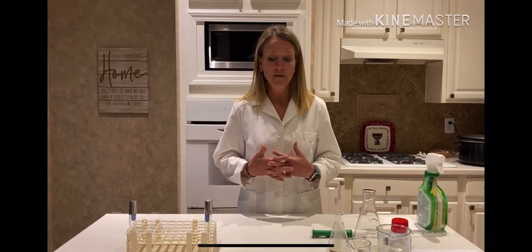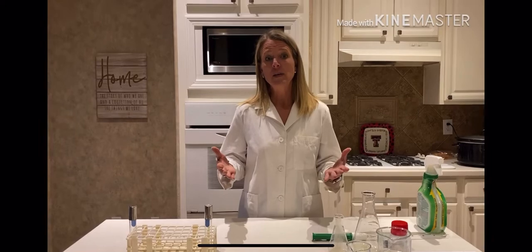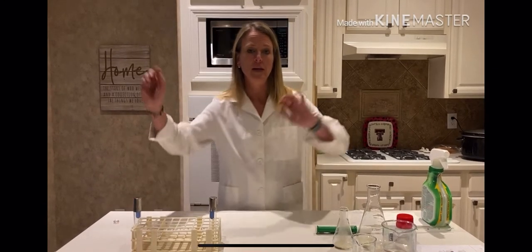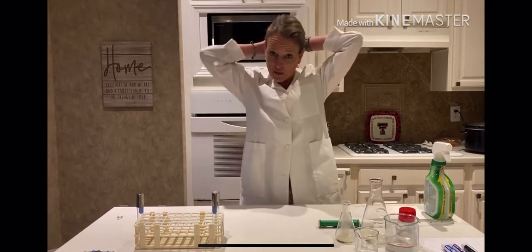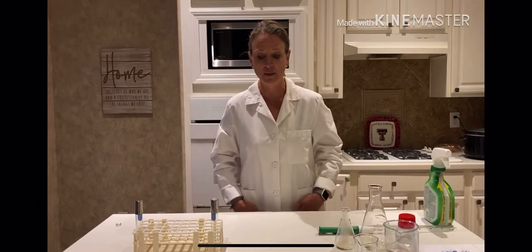First off, we have to practice aseptic technique. You'll notice I've got rings on my fingers, which I shouldn't have, so I'm going to remove my rings. And then I'm going to pull my hair back because if you have long hair, you're supposed to pull your hair back. Just a couple of things to make sure we're being as aseptic as possible.